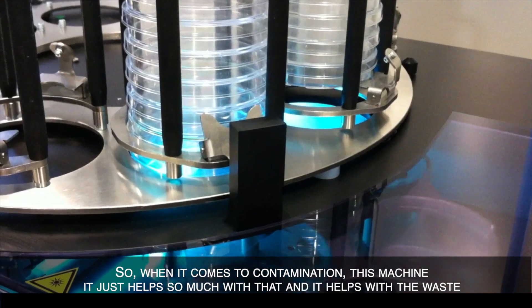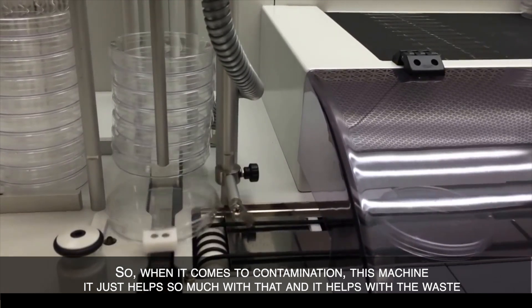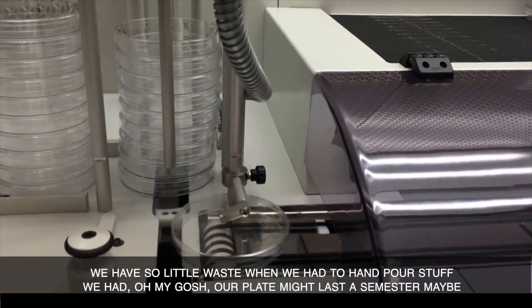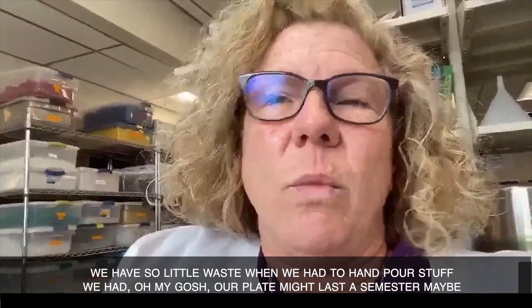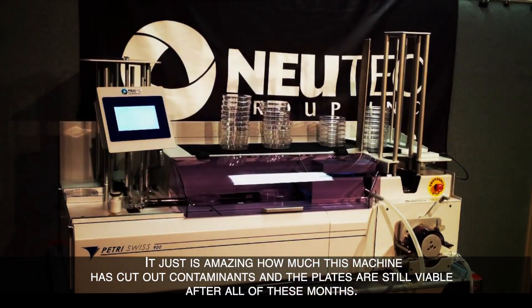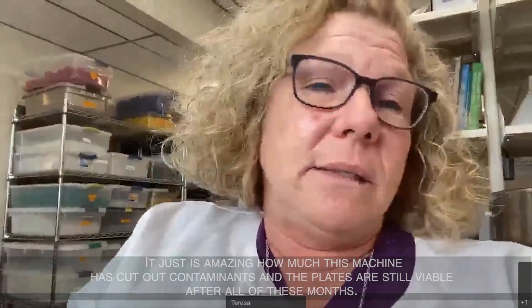When it comes to contamination, this machine just helps so much with that. And it helps with the waste — we have so little waste. When we had to hand-pour, our plates might last a semester, maybe. It's amazing how much this machine has cut out contaminants, and the plates are still viable after all of these months.